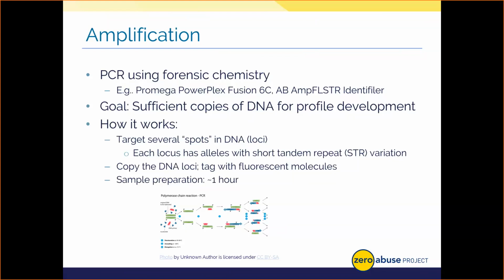We need to make a lot of copies of DNA to ensure we can observe all the unique alleles and, as a result, the overall profile for the evidentiary item. In fact, PCR is exponential or nearly so. So every cycle we have a doubling of DNA being made. So if we start with 2 pieces of DNA, we get 4 pieces of DNA and then 8 and 16 and so on. Thus, we analyze the uniqueness of a person's alleles for a given locus to generate stats for the overall DNA profile, and you use that information in court.